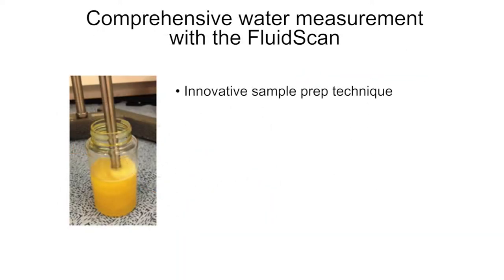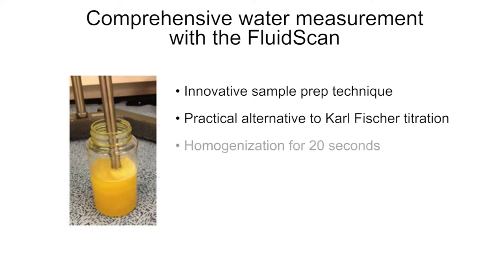An innovative patent-pending technique for sample preparation for the FluidScan makes it a practical alternative to Karl Fischer titration. The sample is homogenized for 20 seconds and let sit for one minute. Homogenization is used because free water is not uniformly distributed in the oil sample but shows as discrete droplets of water. High-speed homogenization breaks up these droplets and creates a uniform distribution of water in the oil.